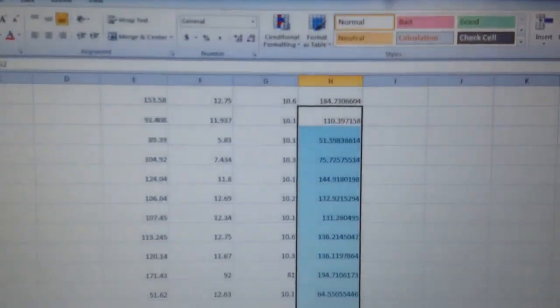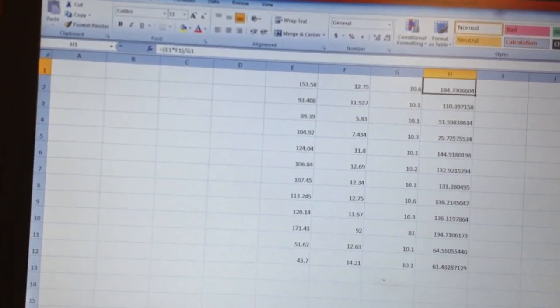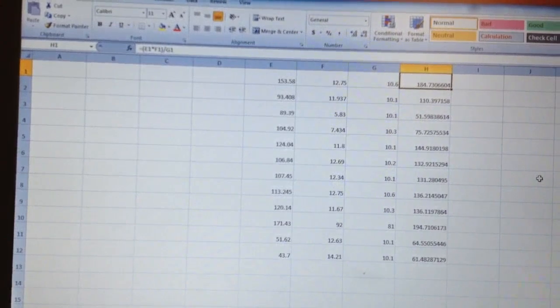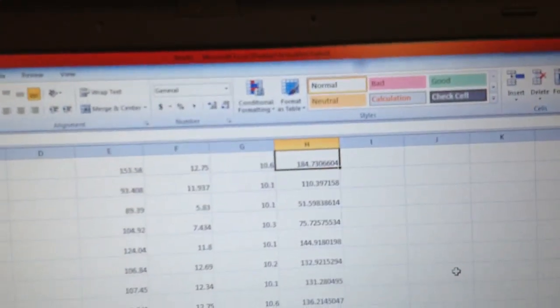Alright, so I hand calculated everything out on what we're doing. There's all of my math, but instead of just actually doing it with a calculator, I wrote everything down, then threw it into an Excel sheet. Once I threw it into an Excel sheet, then I used that formula right there. And that is basically what we ran times standard area divided by the bottle. And then that gives us our new standard area number.